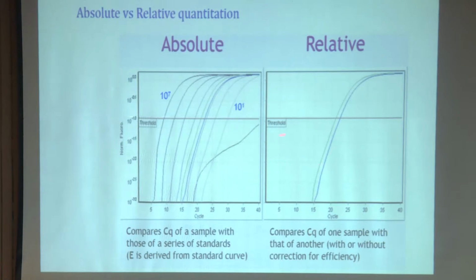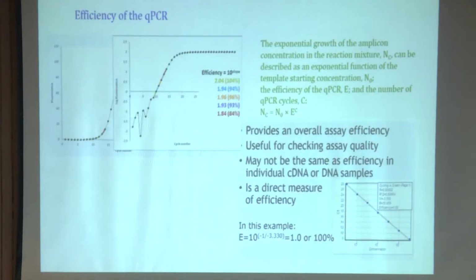So that threshold value is also made use of. I'm not getting into it now, because we will now only learn more about absolute quantitation, right? Theoretically it looks very interesting, because you understand everything is going very perfectly and you have PCR efficiency is good.